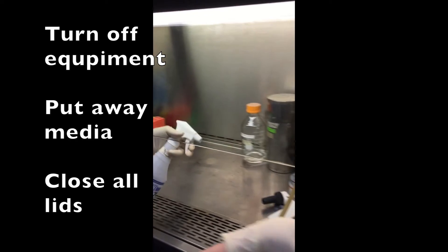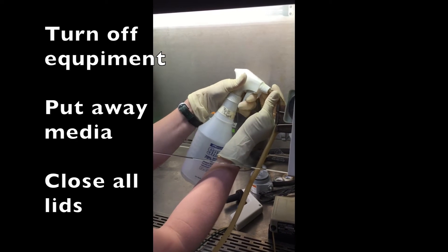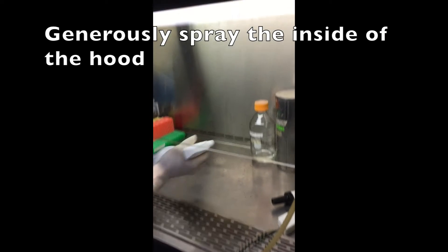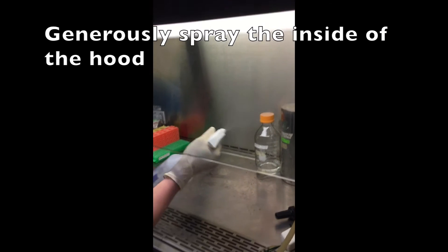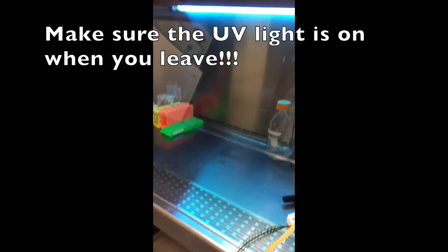While the vacuum is still on, go ahead and take the end of the tube and just squirt some alcohol down it. Then spray the entire hood — make sure you get the bottom really well. We'll mist the tip and bleach that. Once everything is sprayed down, make sure the UV light comes on.